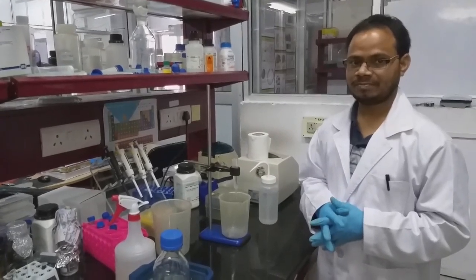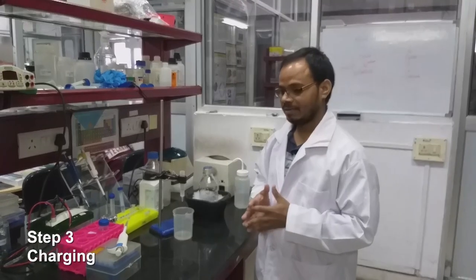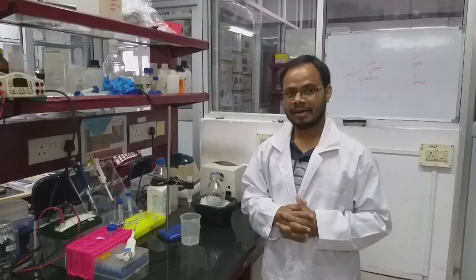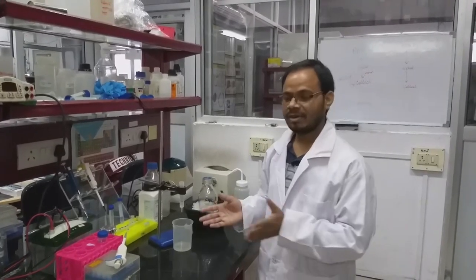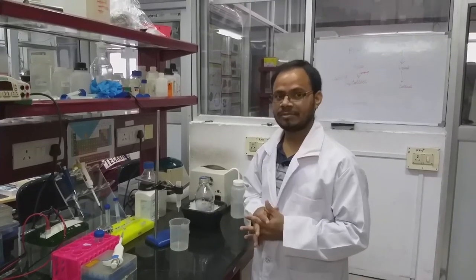the buffer which we used for the lysis of the bacterial cells. Before equilibration of the column, we have to charge the column. For nickel NTA, there are two types of beads. One is readily charged beads which come from the company, and for the other, they give only NTA agarose beads, so we have to charge them. Here we will charge the beads with the nickel, and then we will equilibrate. We already washed the column with water and 0.2 normal NaOH, and again with water.